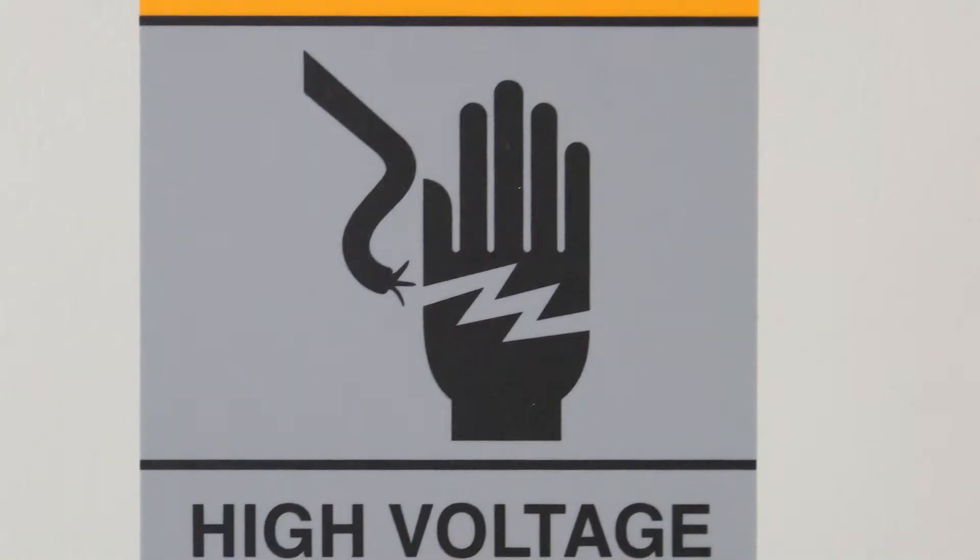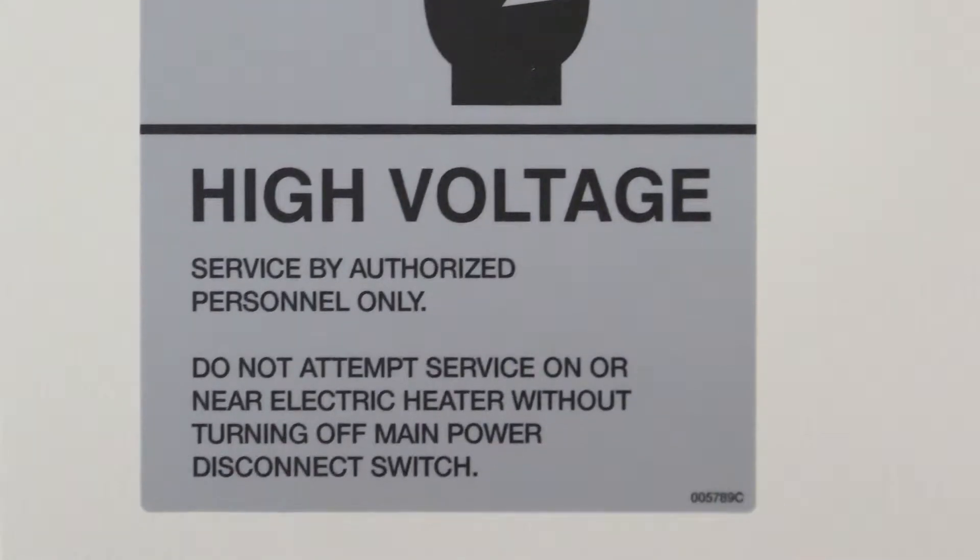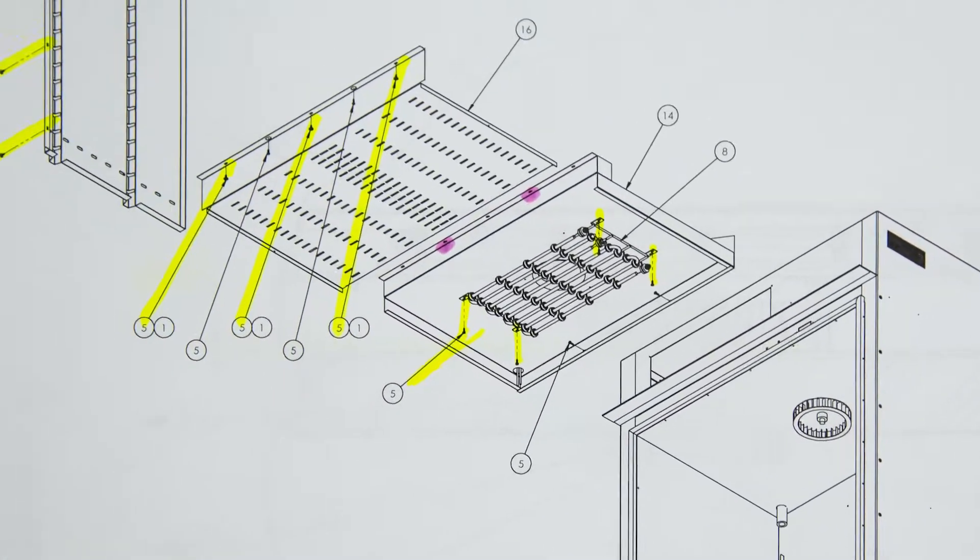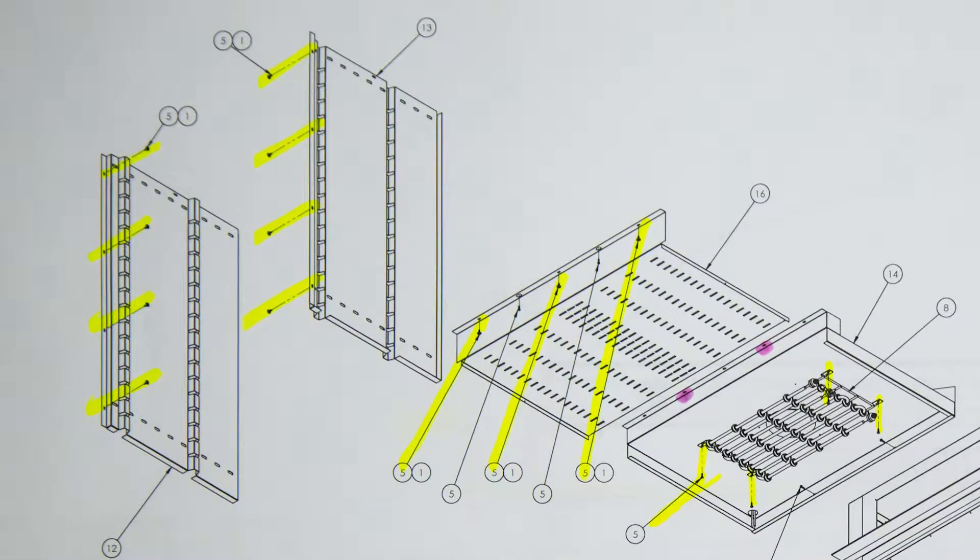Before beginning, be sure to follow all electrical safety precautions. To access the fan wheel, you will need to remove the side panels and the heater panel and cover.